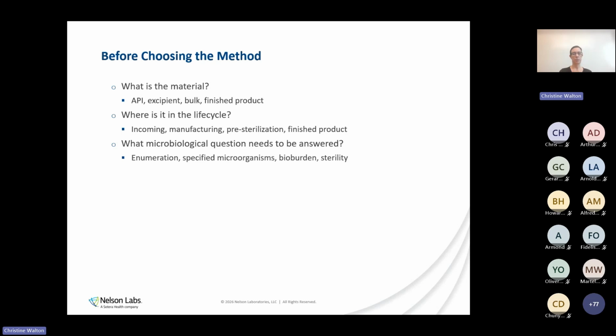Understanding which of these questions we're trying to answer changes with the life cycle of the product. And then even more, sometimes a step I think we unintentionally skip over is what decision we'll be making from that result. It's not just the answer we get, but what are we going to do with it? So make sure that those are appropriately tied together.